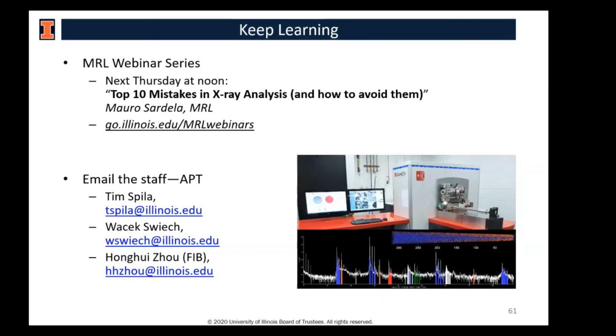No, that's fine. So there's no problem really with the charging, unless there is a situation when the sample is non-metallic. But typically it can go very smoothly as well. So there have been atom probe runs on samples taken from moon rocks, and rocks, and they went very, very smoothly.